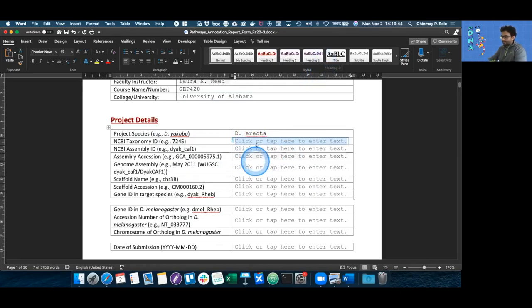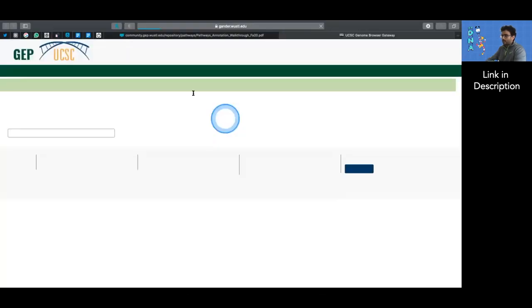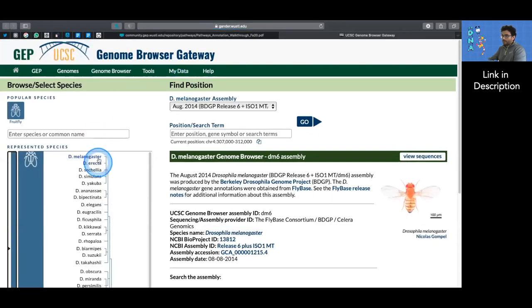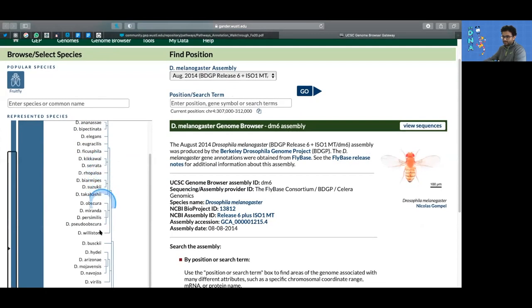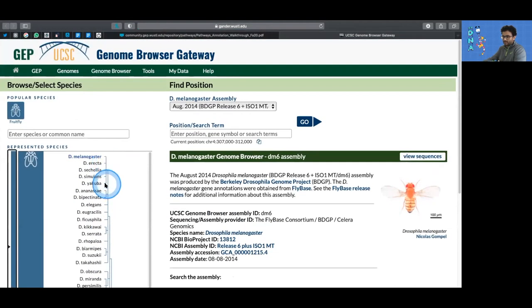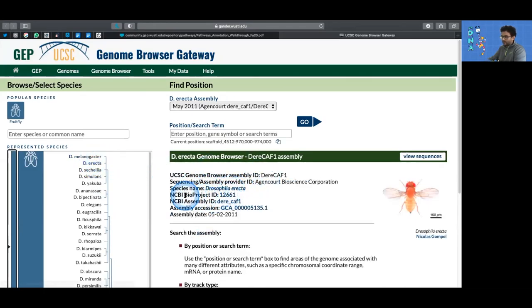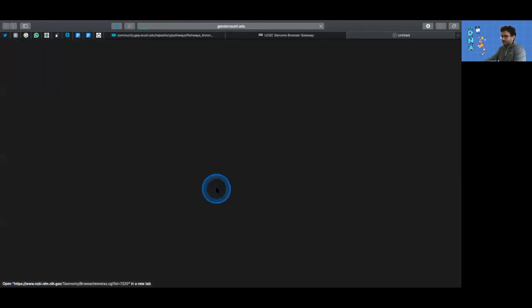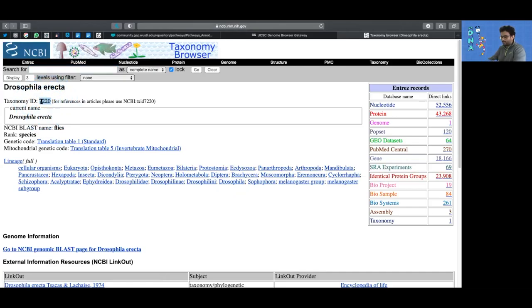To get the NCBI taxonomy ID, you'd have to go to the genome browser. On the genome browser, you can select your species from this box down here. For me, it's going to be Drosophila erecta. After that, I can click on the species name that pops on the right. On the top left of the page, I should have my taxonomy ID. In this case, it's 7220.